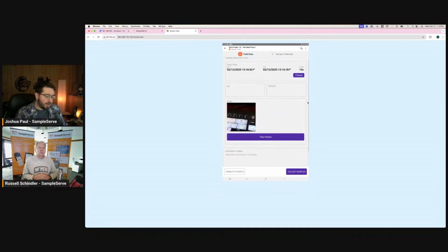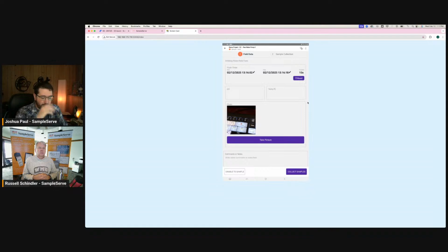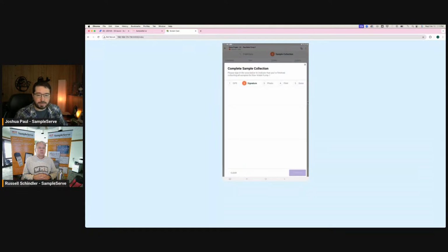So let's pretend that I filled all this out in real time, real life. And I'm going to hit the collect samples button. And this is where we're going to go into SampleServe's patented chain of custody process, where we document the who, the where, and what of who took these samples. So I'm going to sign my name here. It's going to be my signature.